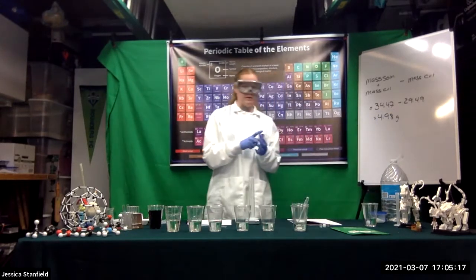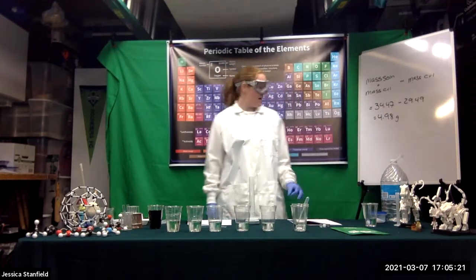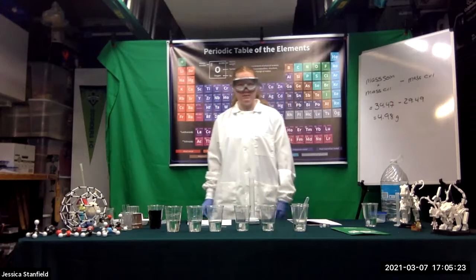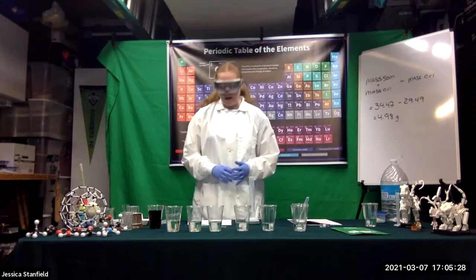And that's good, because we said that the density of water was approximately 1 gram per mil. And I have 4.98 grams for 5 mils of water there. So that's not bad. So I'm going to do that for all of my measurements.